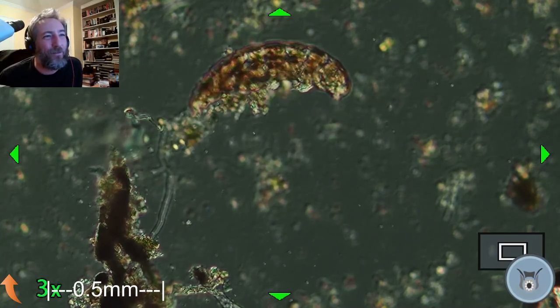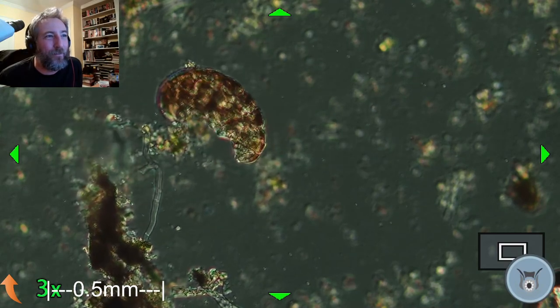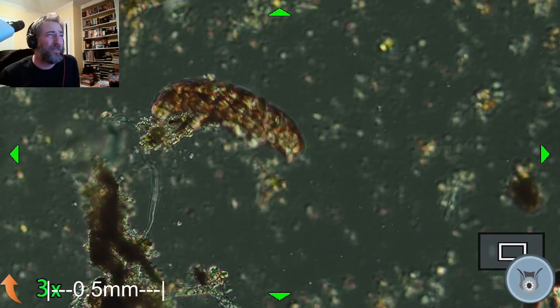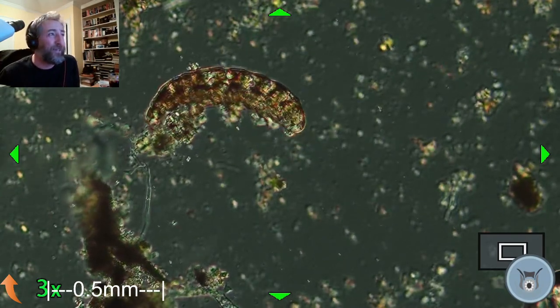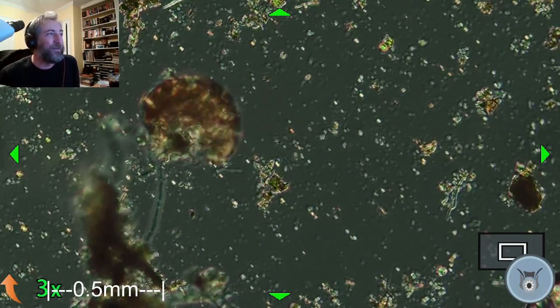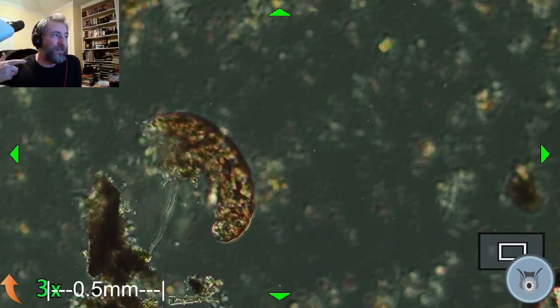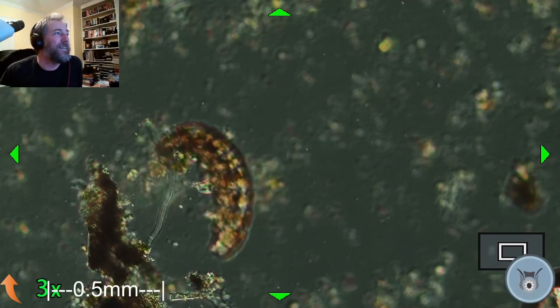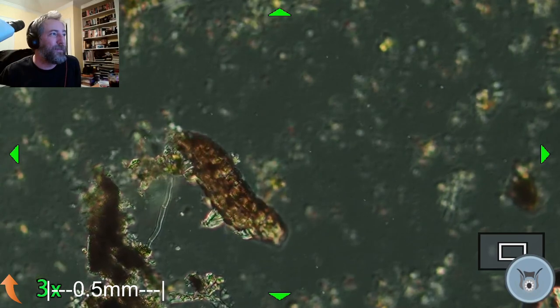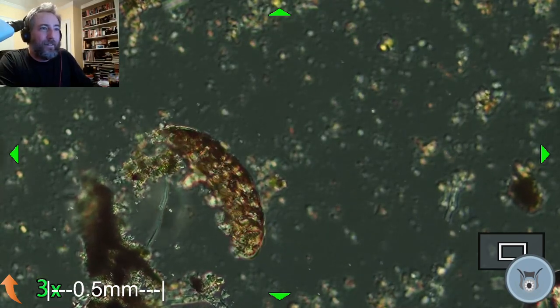Are there many types of water bears or only two kinds? I don't remember where I saw that they found saltwater bears. There are like 500 known species of water bears or something like that, and they have different genera. So there's way more than two. In my sample here, we've only seen two kinds. We saw that really big lady, and then we've seen these little armored guys. And I've seen another type. That's actually the first time I've seen that really big one on a stream from my yard.